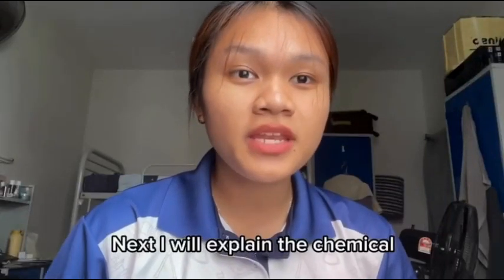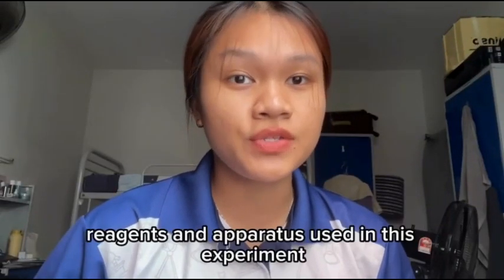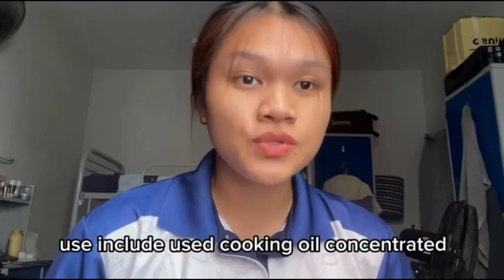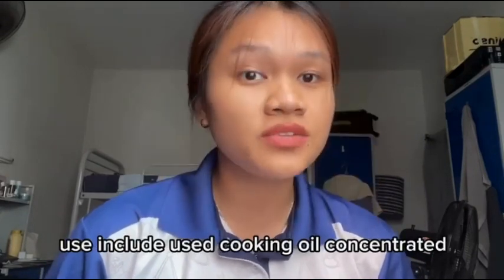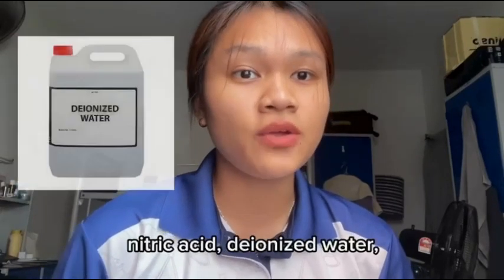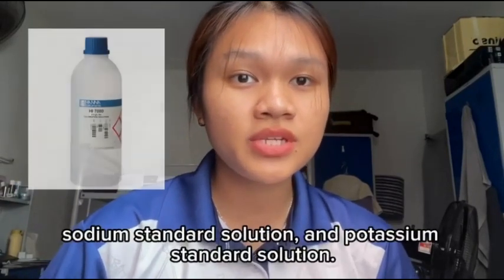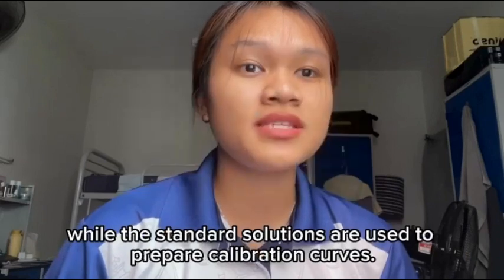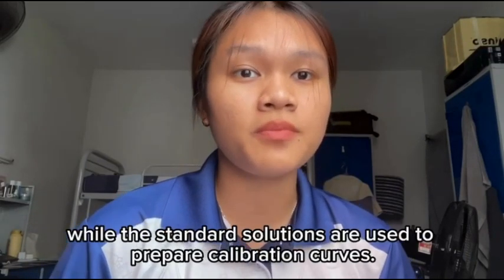Next, I will explain the chemical reagents and apparatus used in this experiment. The chemicals and reagents used include used cooking oil, concentrated nitric acid, deionized water, sodium standard solution, and potassium standard solution. Nitric acid is used for the digestion process, while the standard solutions are used to prepare calibration curves.